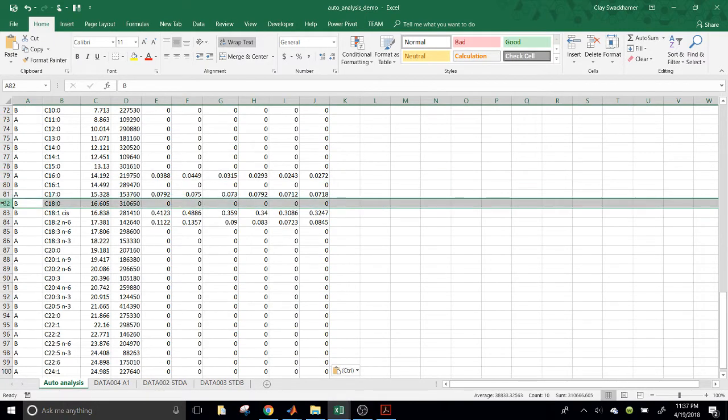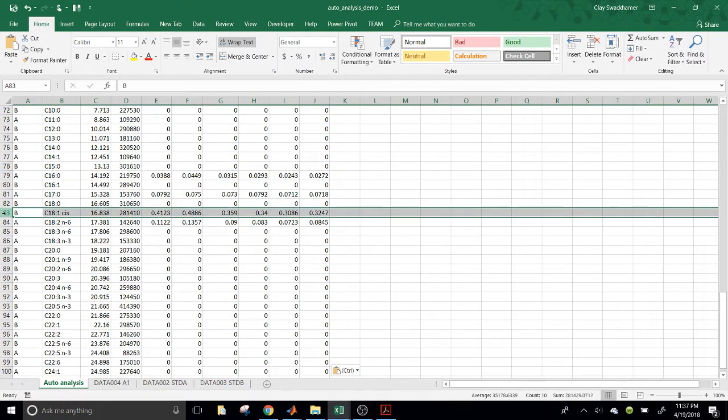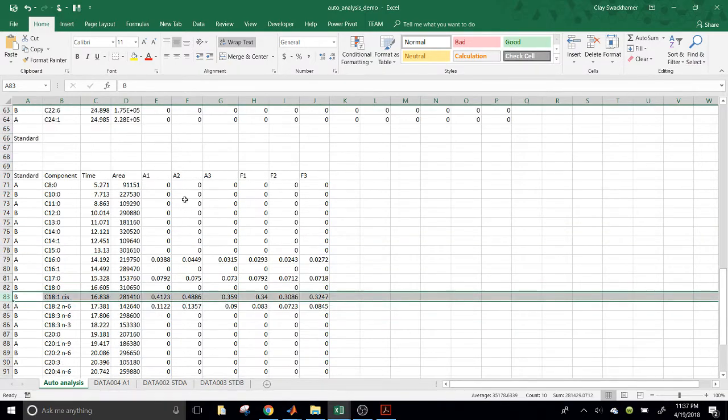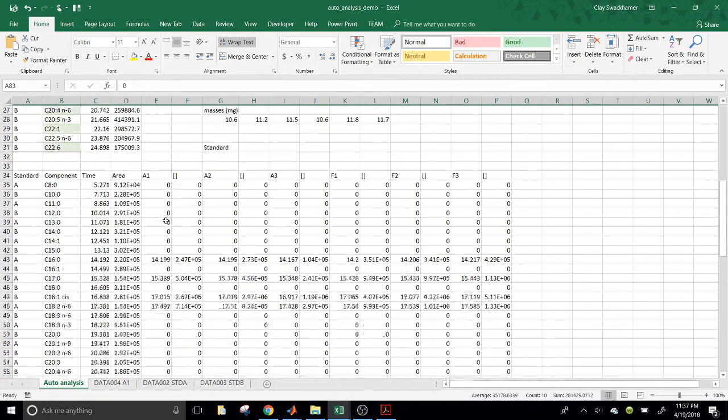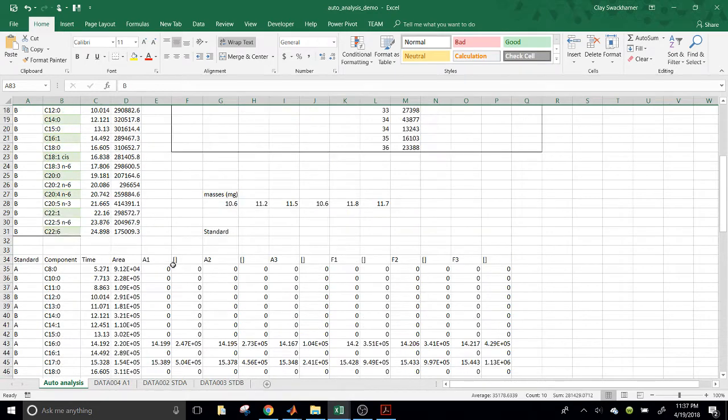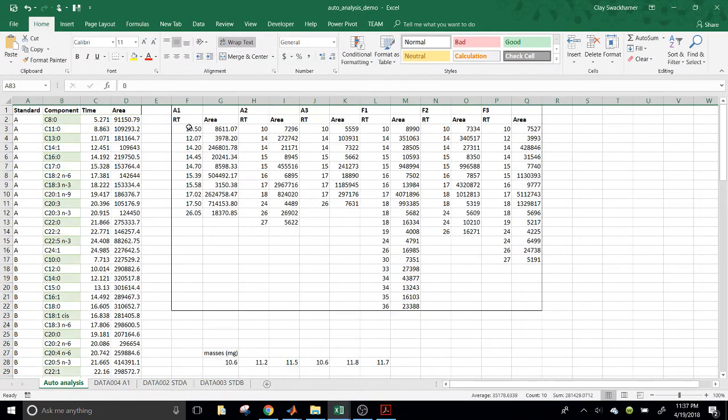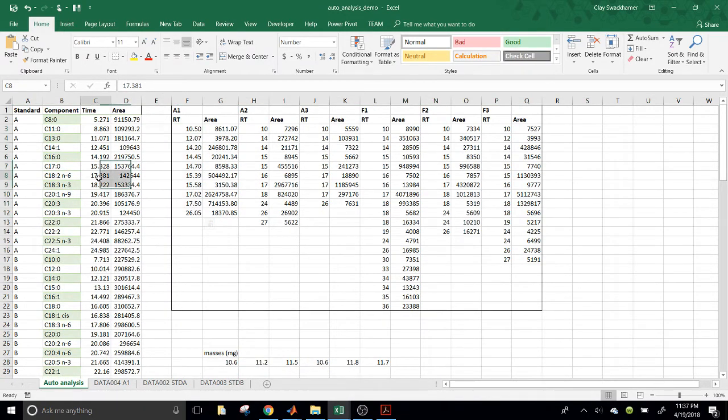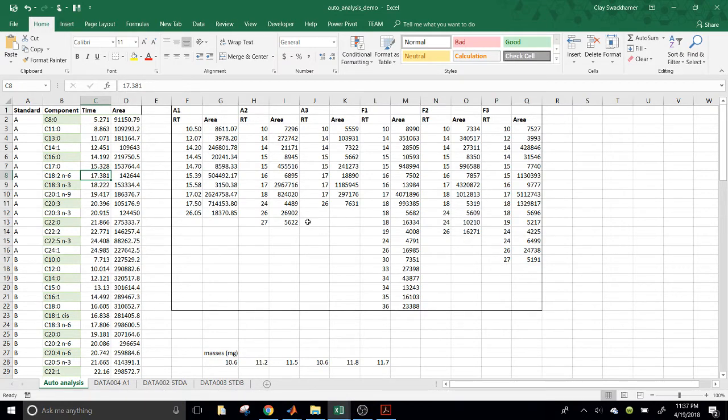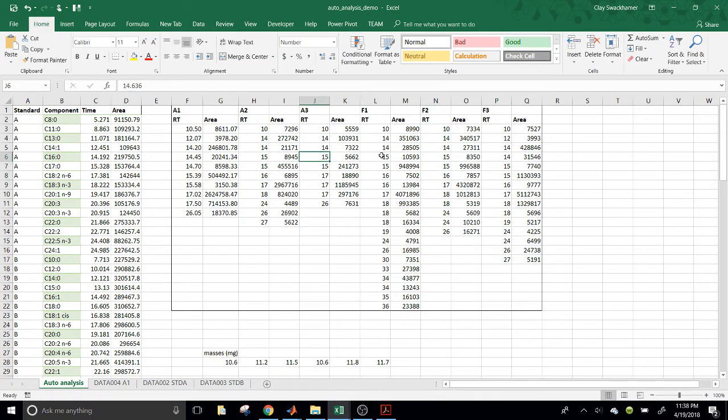So, the way this algorithm works is it's going to match the retention times of all of the peaks in each of these samples to the closest peak in the standard. Now, there can be some problems with this, as you might anticipate. Not every peak in every sample will necessarily be the closest peak of all peaks in that sample to any one peak from the standards.